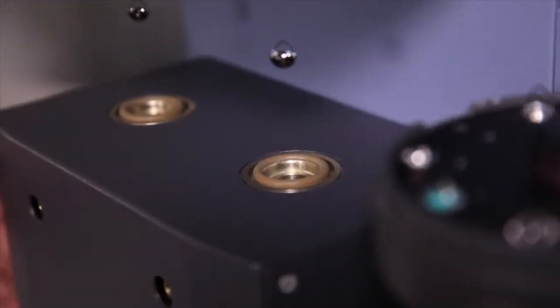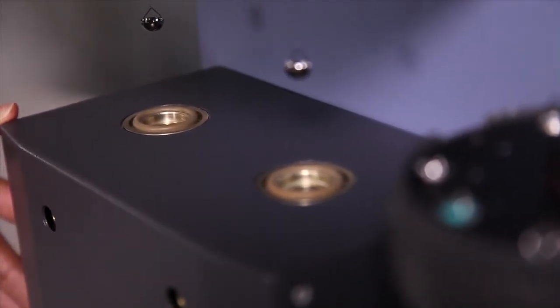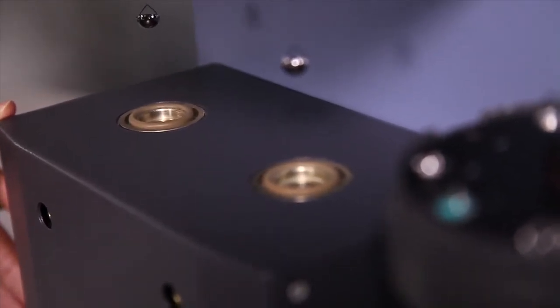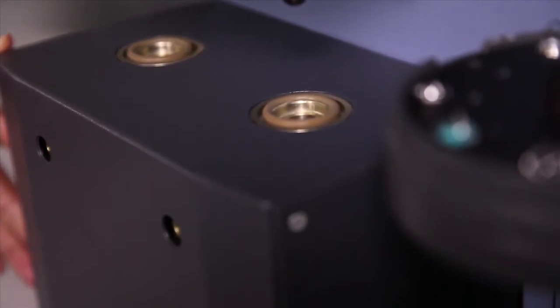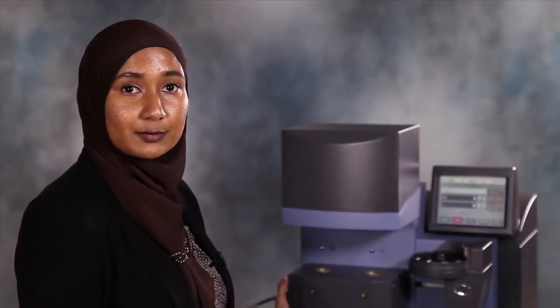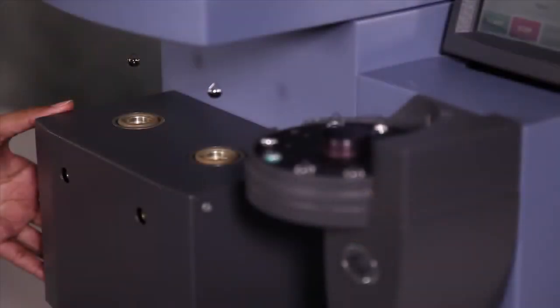The humidity chamber has an operating temperature range of 5 degrees Celsius to 85 degrees Celsius and a relative humidity range of 0% to 98% plus or minus 1% accuracy.